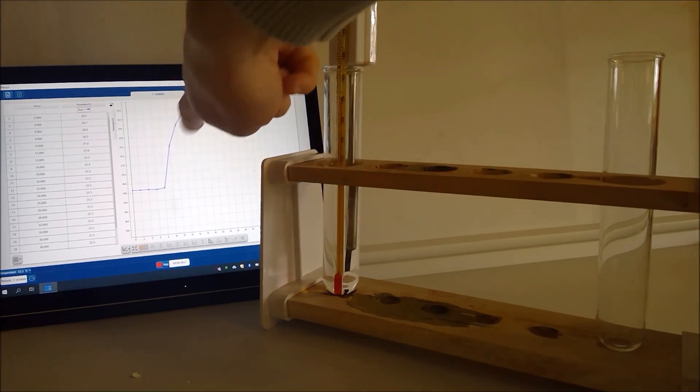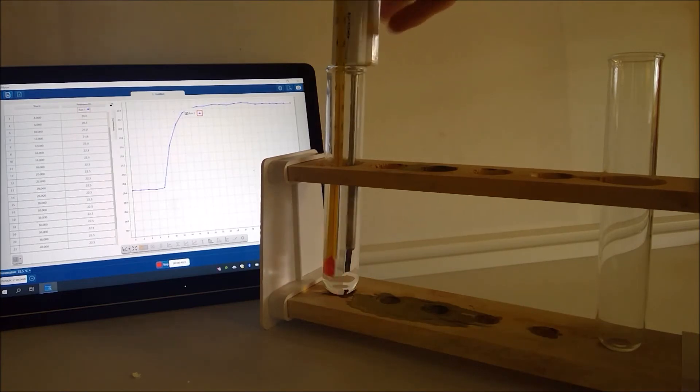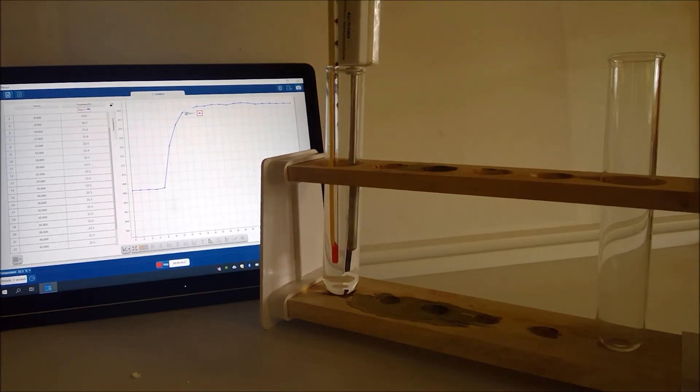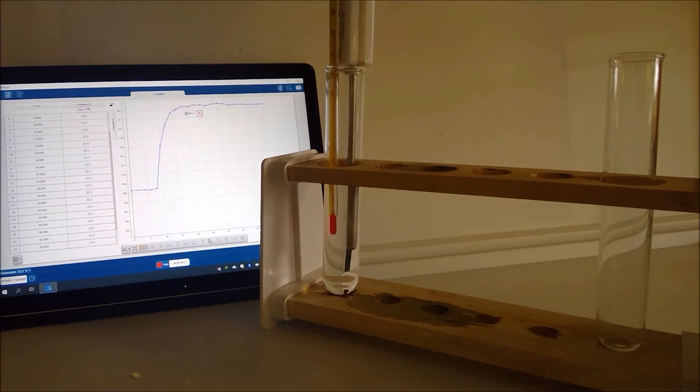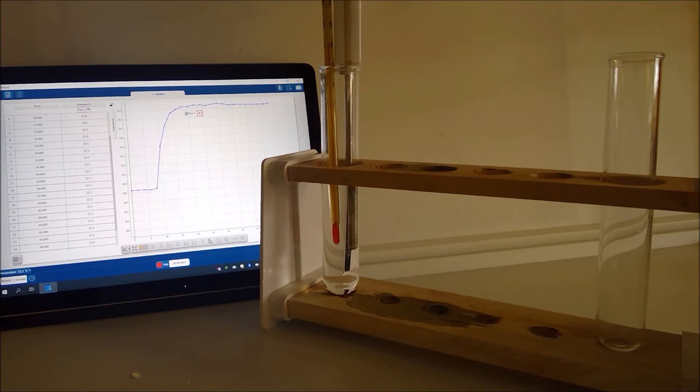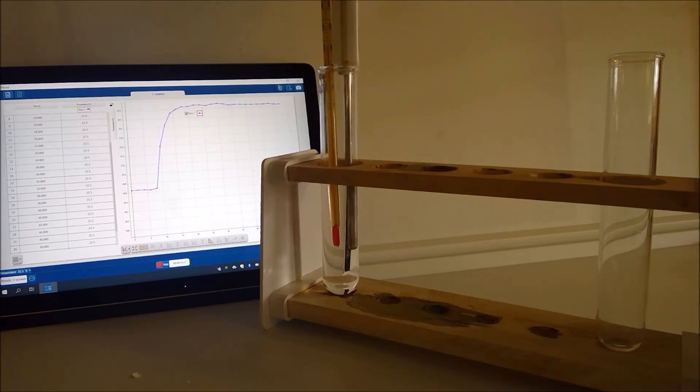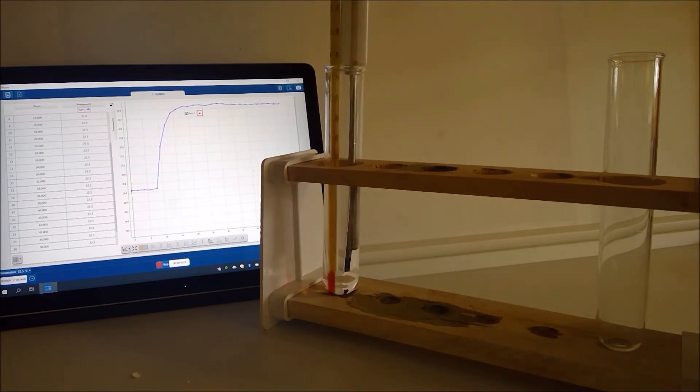So it's looking now like we've got a pretty constant temperature and looking at the thermometer again it hasn't gone any higher than our 23 degrees here.